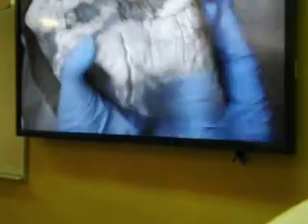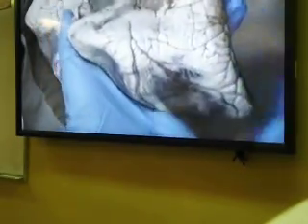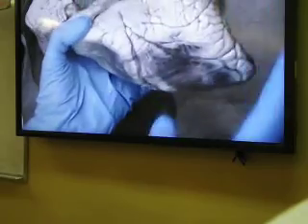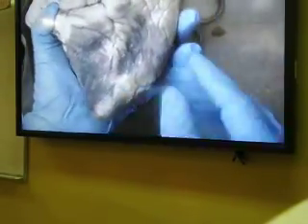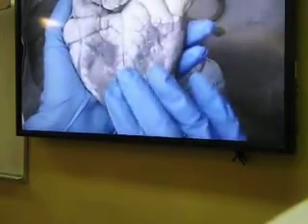is everything that we talked about for the human heart. So the very first thing I will do, remember, I have to understand where is the anterior aspect, also called the ventral aspect, and where is the posterior aspect, also called the dorsal aspect. So a little while ago we said the anterior view is a little bit rounder, has a ridge, and so this is my anterior view, and this is the posterior view, more flat. If you look at this one, same thing, this is the anterior and this is the posterior.